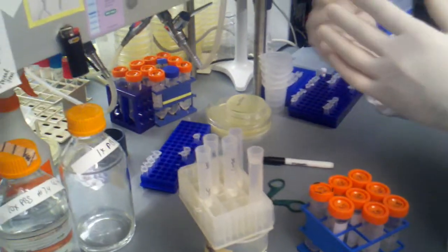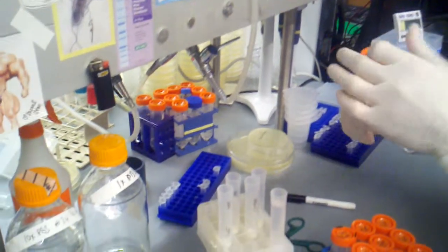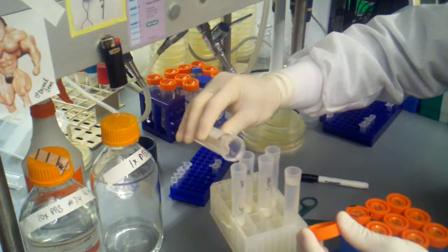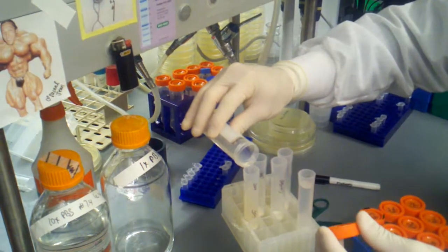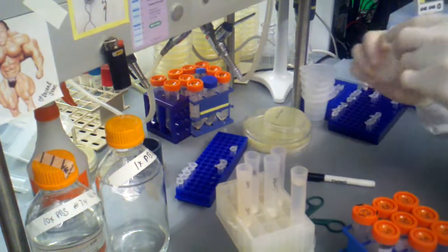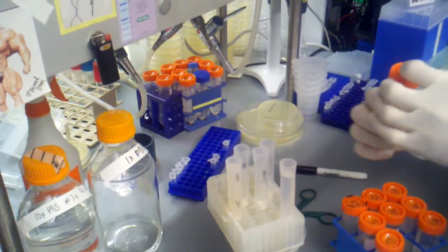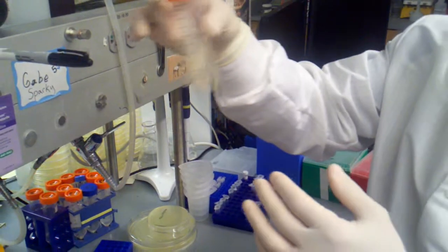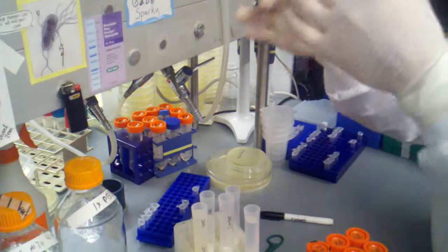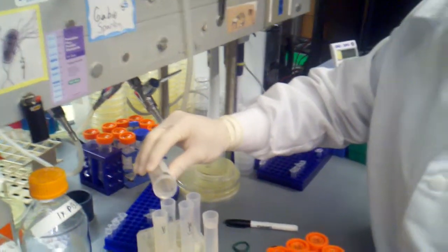What we have to do is a little trick to make it start flowing through. And then our 605, I've got to shake that up a little bit. You want to make sure that everything's well suspended before you pour it off. Otherwise, you'll just pour your lysate and all of your resin will remain back in that tube, and it might just come off as a clump, which is no good. I almost forgot about that one. Just resuspend it, make sure it's really resuspended, and then pour it on in.